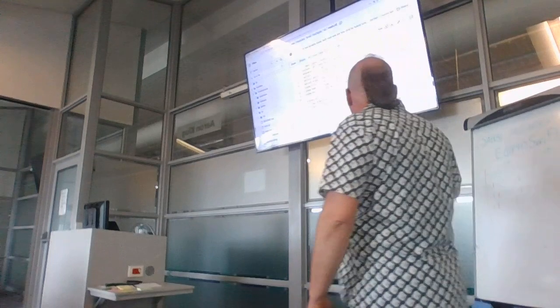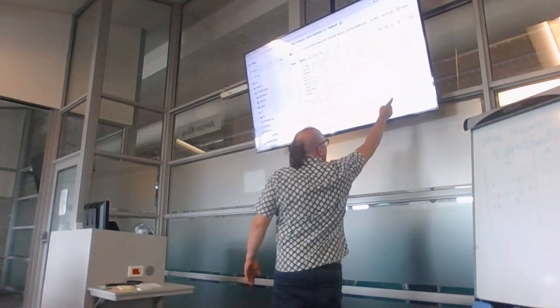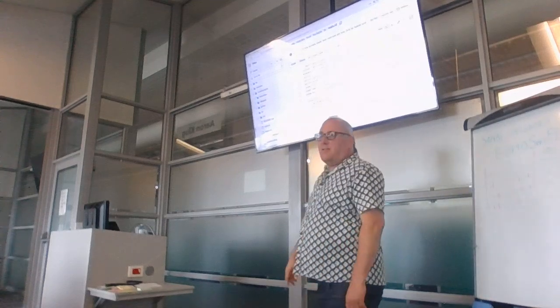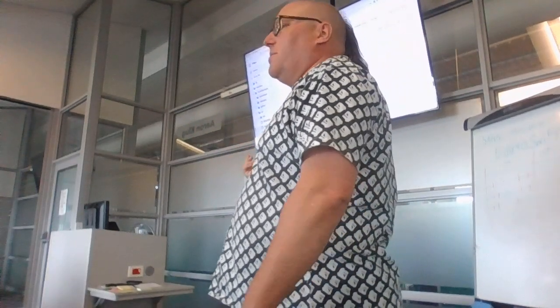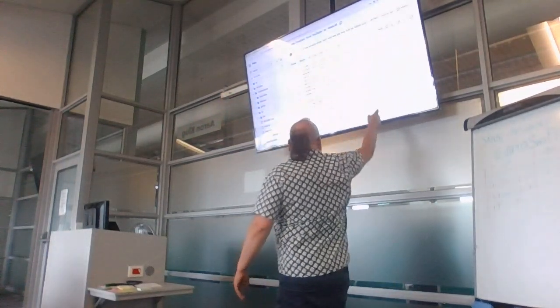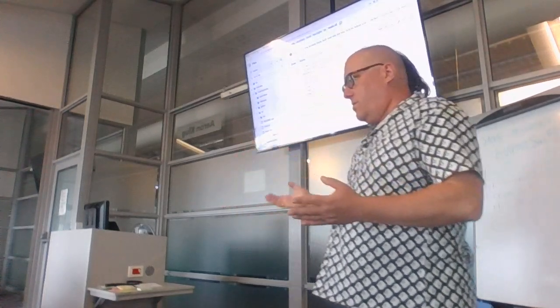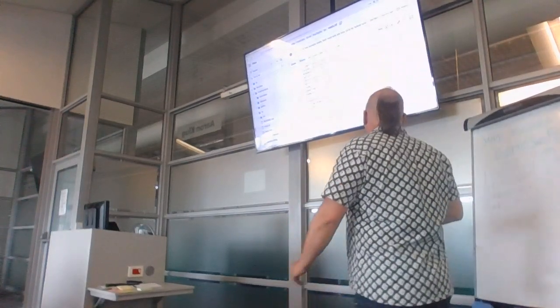Simply because there's something actually quite interesting here. Line 17. If we're using Singularity, okay, then download a Singularity container from, do you see what it says here? The Nextflow people use resources built by the Galaxy community to get their containers. And my experience with this website where they download Singularity containers is that it's kind of slow, okay? Because it's a free project, you know, with just one server and all of those things. I have pre-downloaded all of the Singularity containers, if anybody wants the relevant ones, okay?